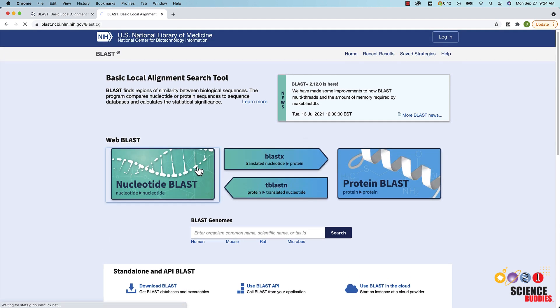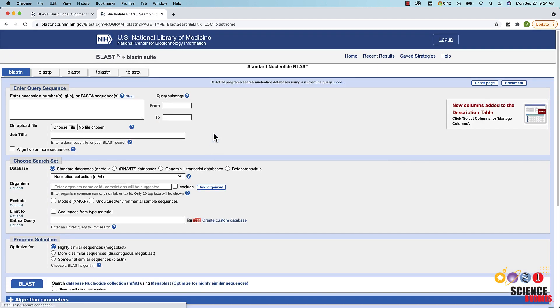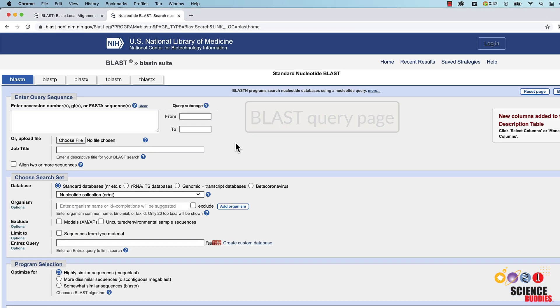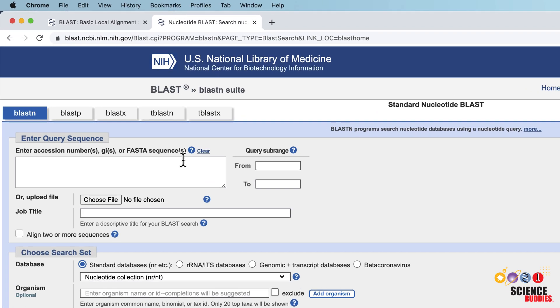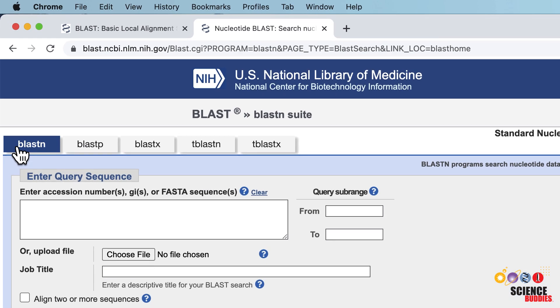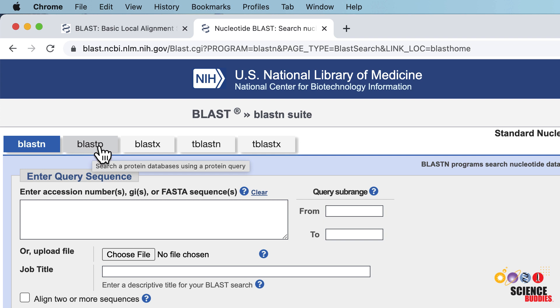Once you click on nucleotide or protein BLAST, you will get to the BLAST query page. Here you have to tell the computer algorithm what you are exactly searching for. On the top of the page, you can switch between the different BLAST options, such as nucleotide or protein BLAST.